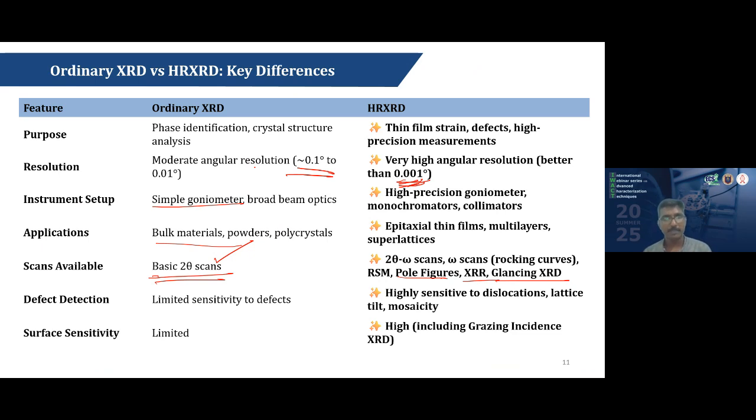in the case of composite thin films, you could do the XRD measurements. You could do normal XRD, or you could do glancing angle XRD. When we do glancing angle XRD, even if the composites or unit cells are tilted to the sample surface, you could measure that also. You could see the peaks corresponding to the tilted orientations also. So it is possible.